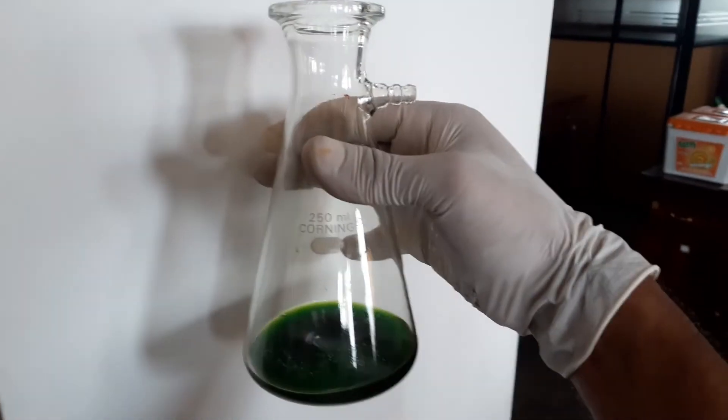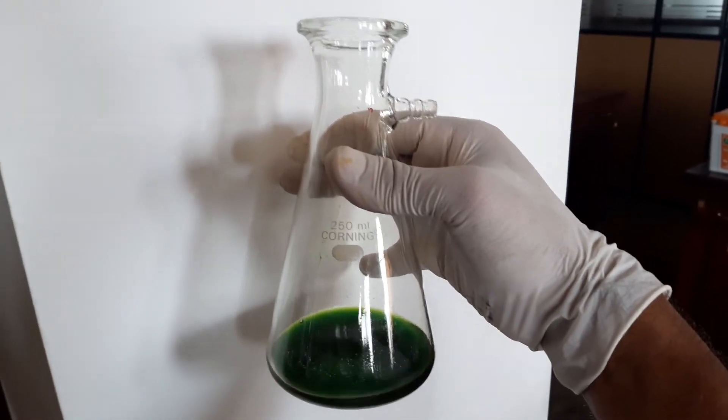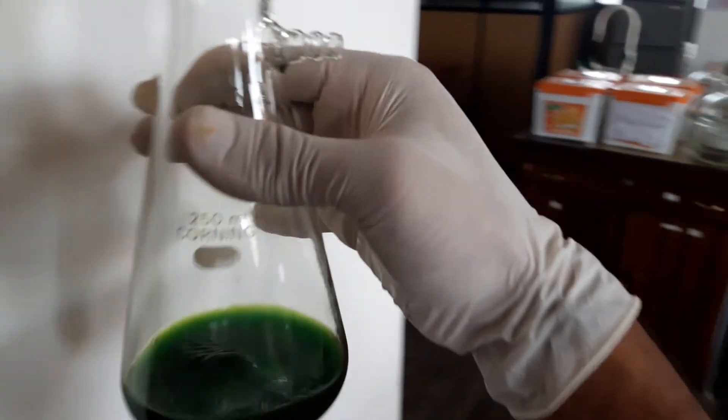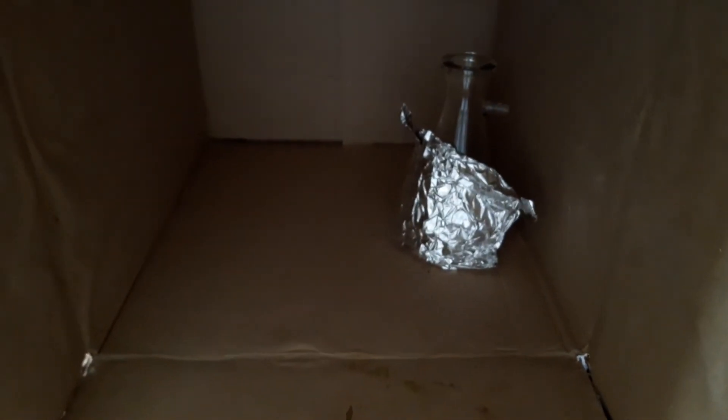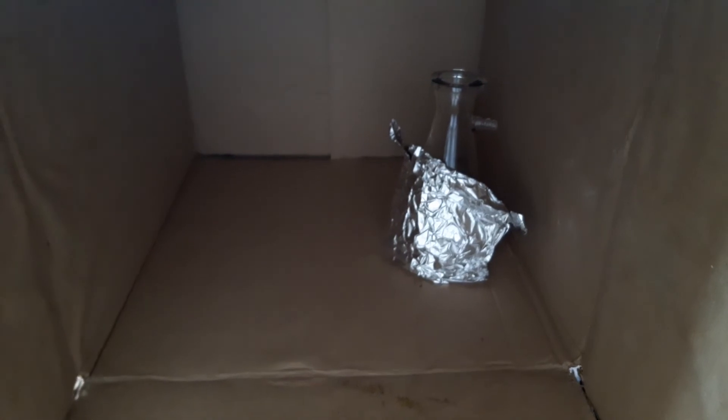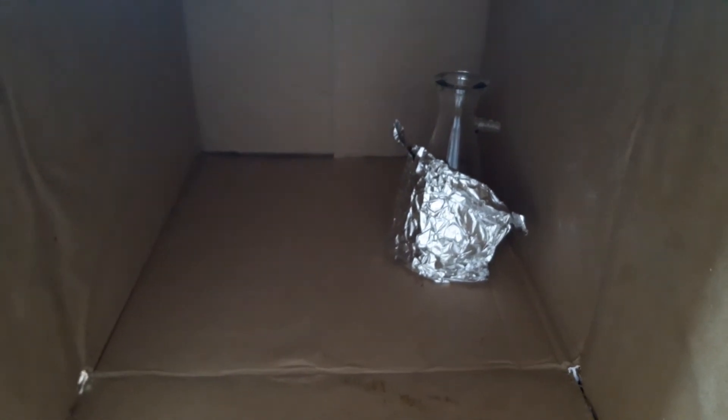The next step is the partition of carotenoids into petroleum ether. To do that, first of all we have to keep it in a dark place and prepare for the partitioning process by putting it into the petroleum ether.